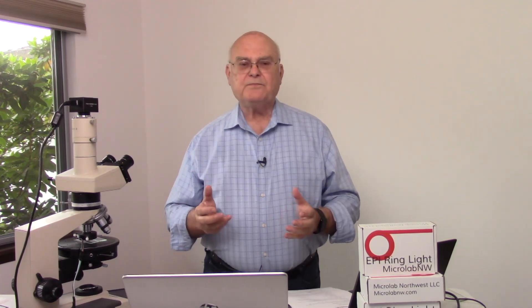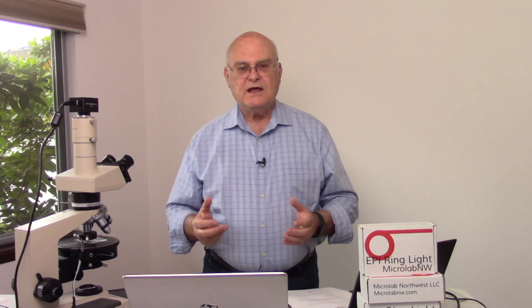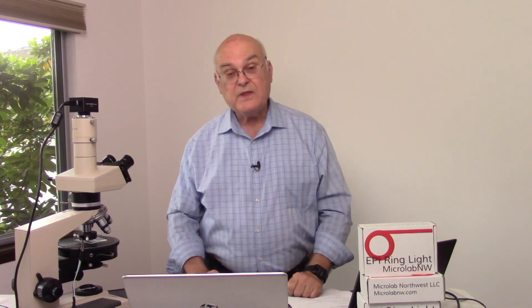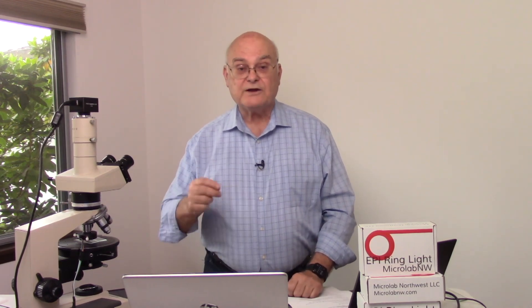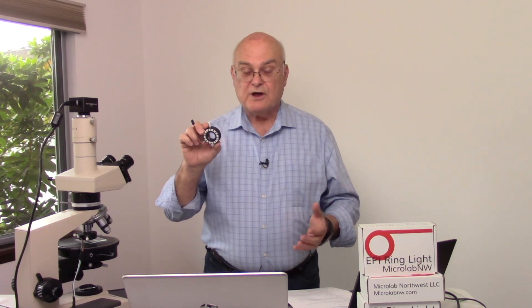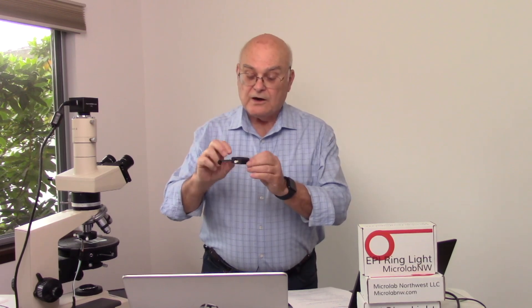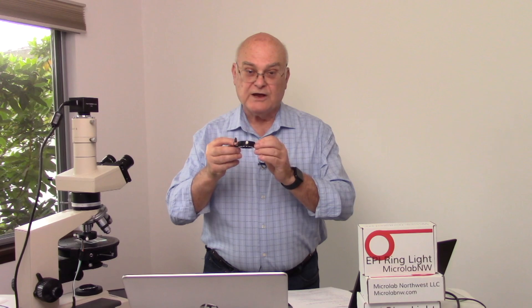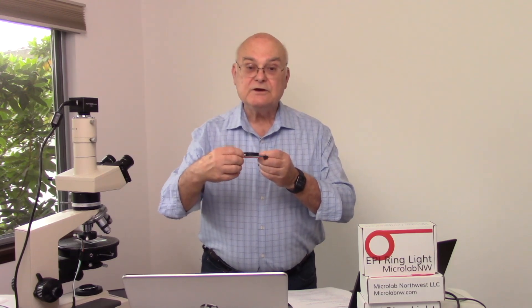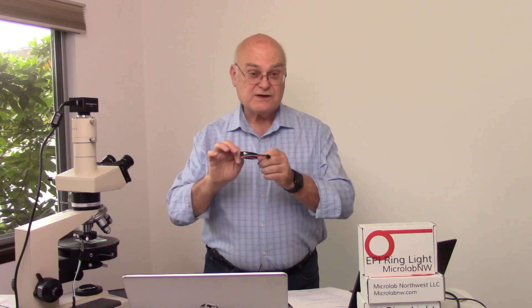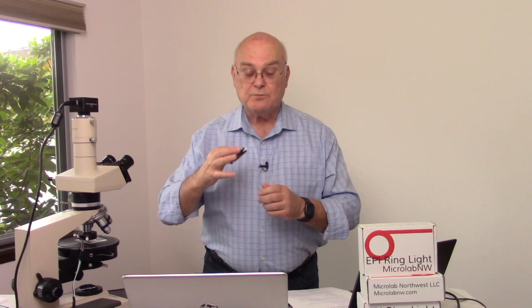One of the difficulties with getting reflected dark field illumination is that we don't have a nice, inexpensive, affordable attachment to provide it. Well, we designed one. This is a ring light that fits around most standard objectives. We can fit it around the transmitted light objective, position it to optimize reflectivity off our specimen, and then use nylon nuts to tighten it in position so that once it's fixed we can go from one sample to another and get the same reflectivity.